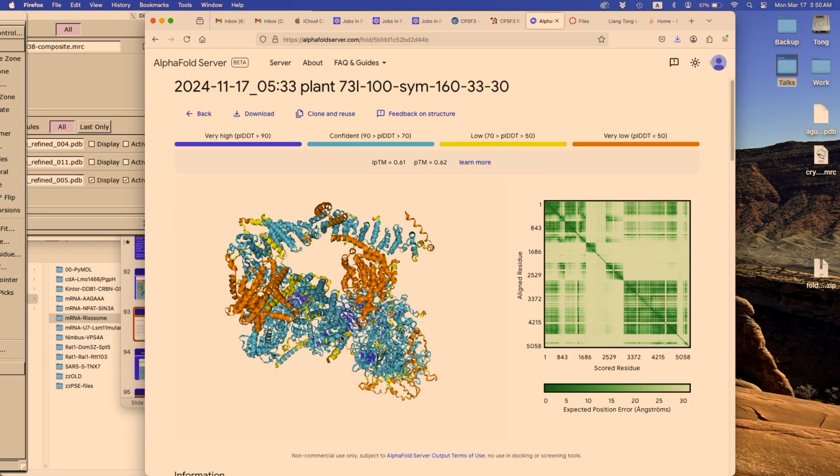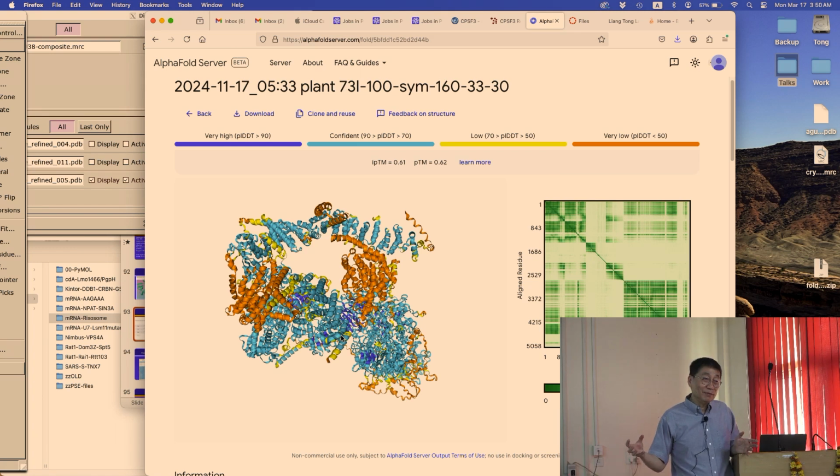But since then, we have determined the structure using cryo-EM. Overall the big picture is the same, but there's a little wrinkle in the actual structure, which is good, because we now have a better story to tell. So I think they are mutually helping each other. Having the model gives you new insight and new ideas to try, and having the structure improves on that as well. Does that make sense? Yes, sir. Okay. Thank you, sir. Are you doing experiments also, or mostly calculation? Yes, sir, I'm doing a little bit of computational structural biology, bioinformatics, and also a few wet lab experiments. Okay.